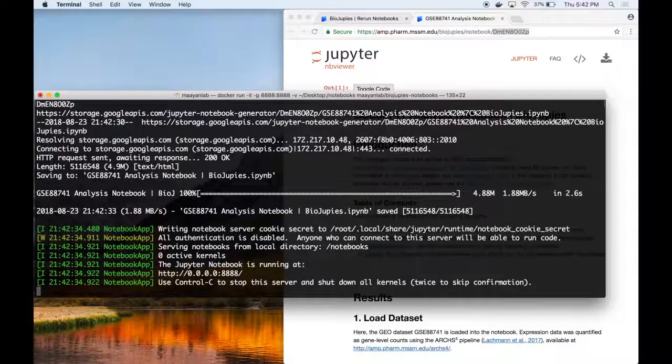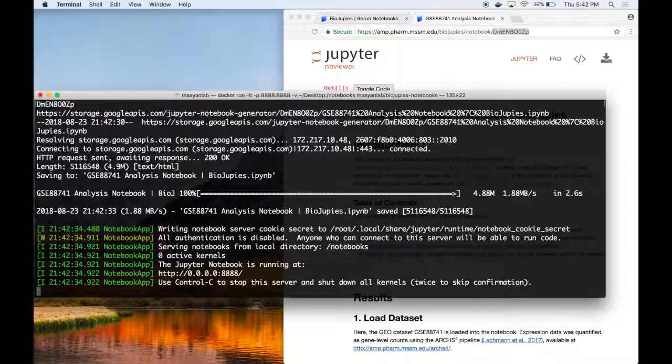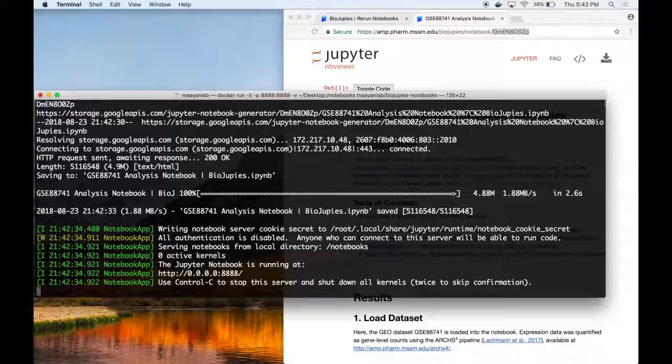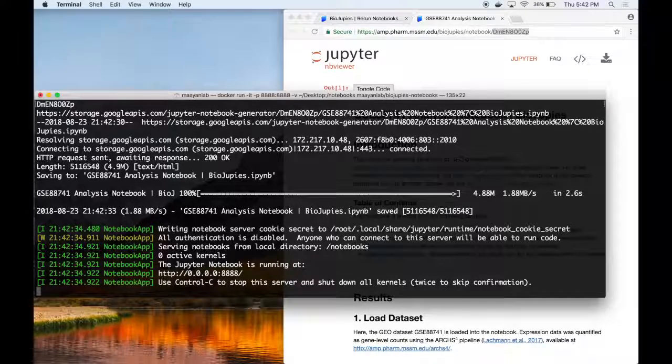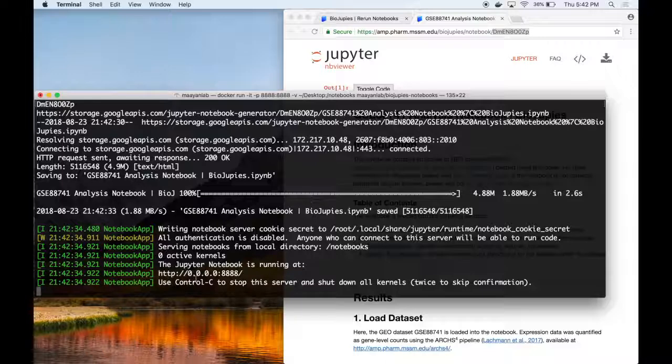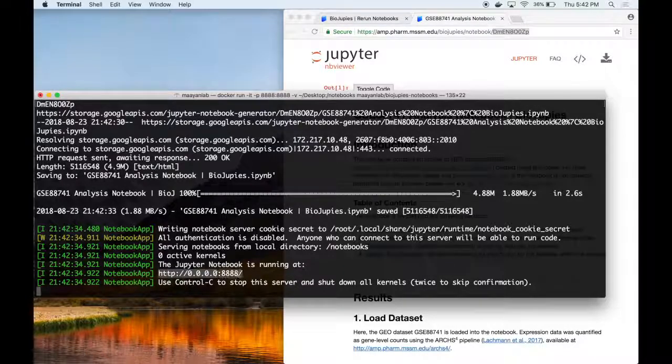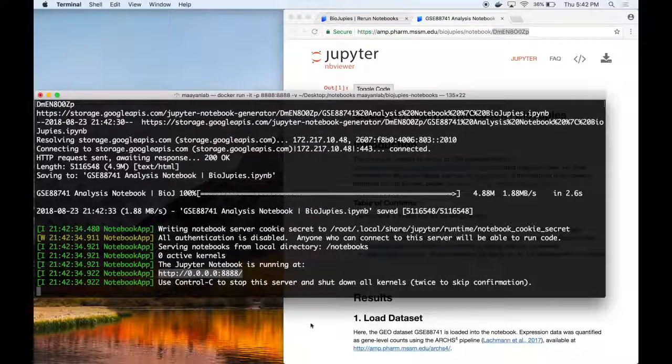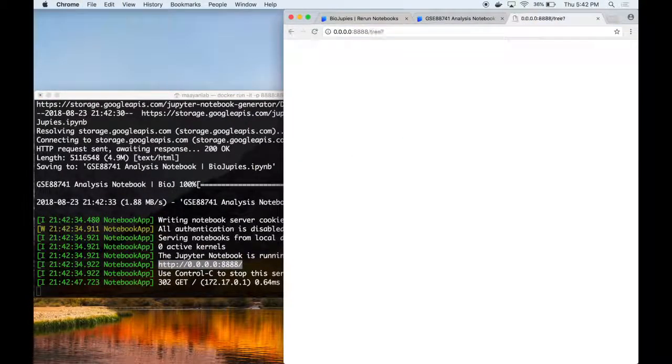During this process, the container is downloading the specified notebook and launches an interactive Jupyter server on your local computer. And in our case, we can access it at the URL shown here, localhost port 8888.